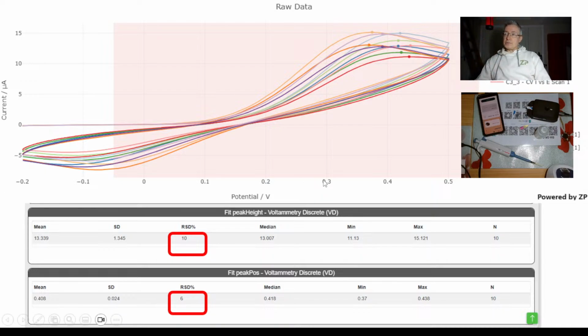But then I was a bit curious because they're very stretched out. And this is when it comes to troubleshooting cyclic voltammetry. If you see this kind of stretching out, it suggests that there's a high impedance somewhere in your measurement circuit. When I say stretched out, the peak position here is approximately 350 millivolts, and the peak position here is about minus 50 millivolts. So they've got a peak-to-peak separation of about 400 millivolts. And ideally, the peak-to-peak separation is 59 millivolts. Now at ZP, we don't try to get that 59 millivolts. I'll do lots and lots of webinars about that.